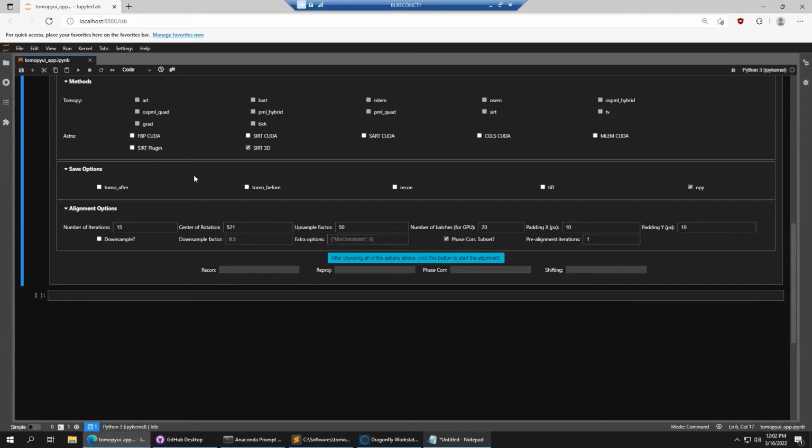Yeah, that's a good question. And I'm going to change some of the names here to make it more clear. But this is just the aligned tomography, all of the projection images in one TIFF image. So it's a TIFF image that's a stack of TIFFs. Yes, yep.